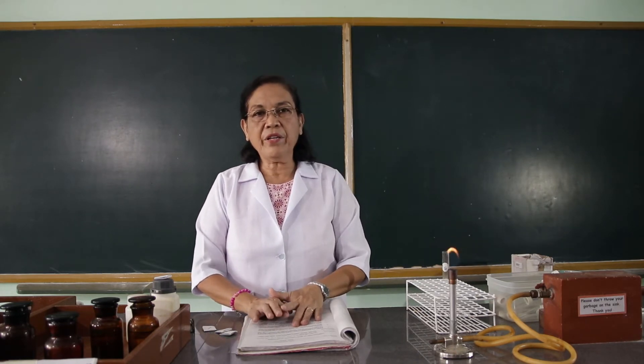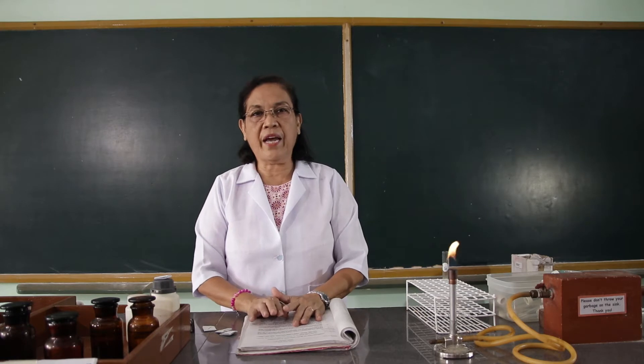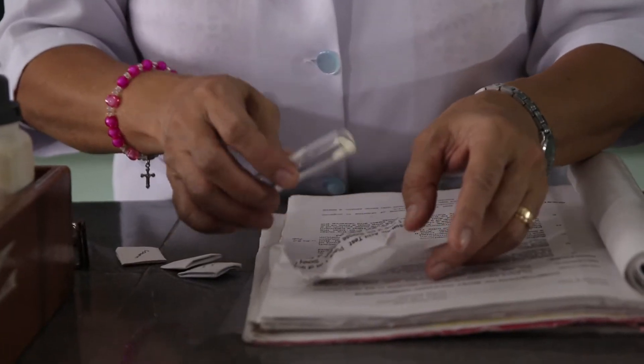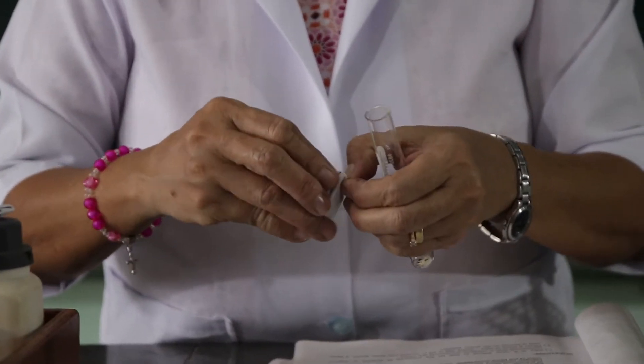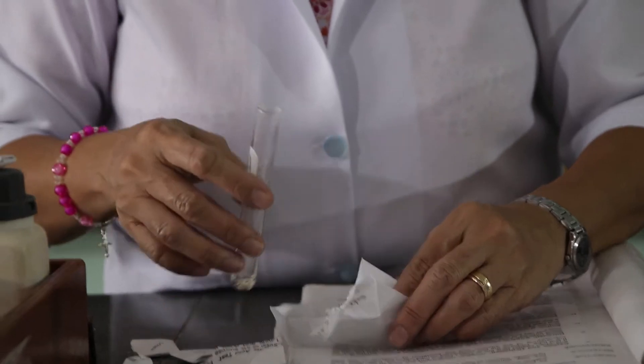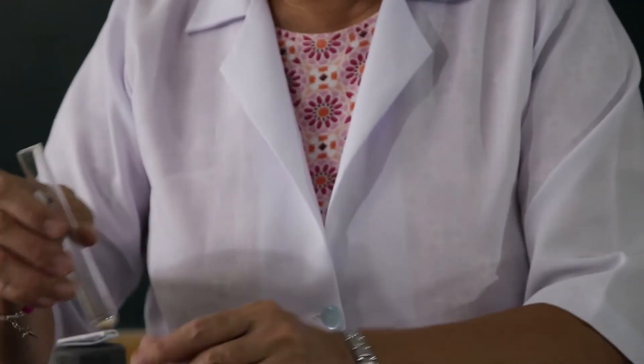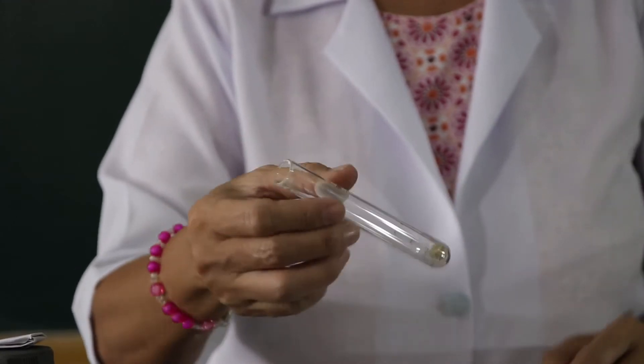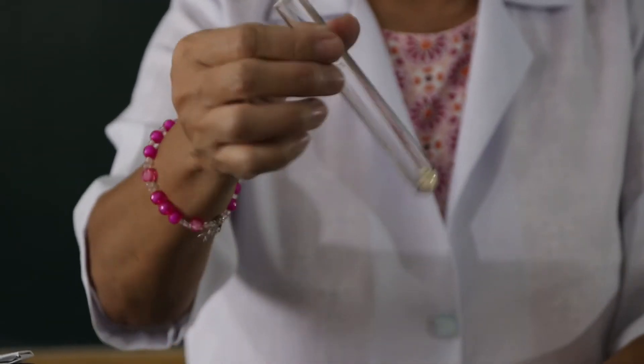So for that first procedure, that is to test for the presence of carbon and hydrogen. The next part of the activity is we are going to heat a mixture of the egg albumin and soda lime. So this is the egg albumin, and we are going to mix this with soda lime. Let's mix the two — the egg albumin and the soda lime.